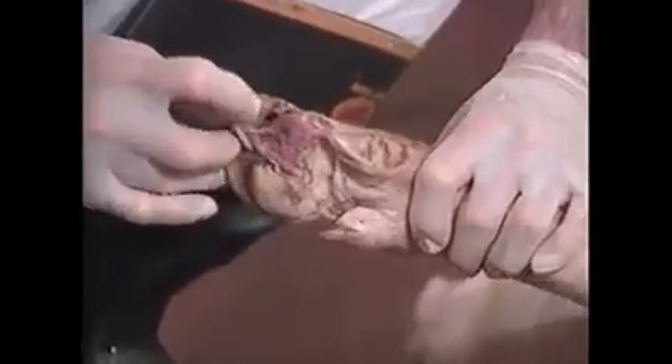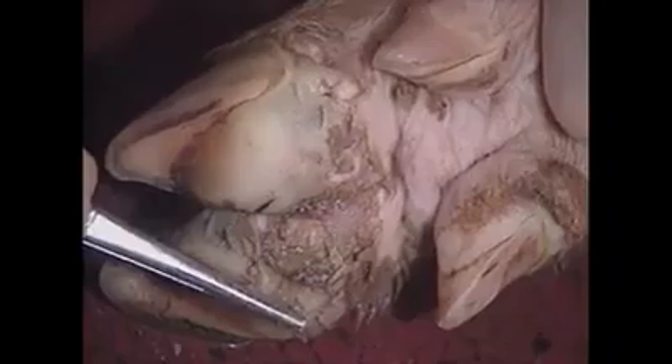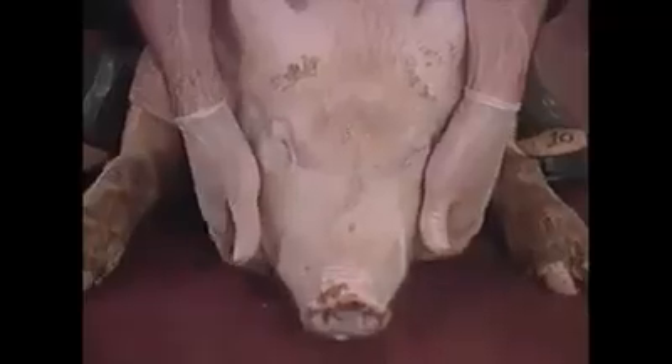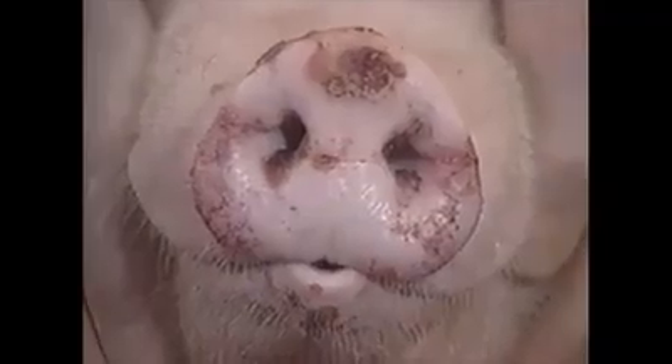This is the foot on which the pig is so lame. There is extensive detachment of the heel, sole, and part of the wall of the claw. The skin over another heel is also detaching. These severe lesions on the feet are typical of acute FMD. The pig has been tranquilized. This is an erosion on the lower lip. The brown regions on the snout are areas of dried skin from FMD degeneration. There is also an erosion on the chin.